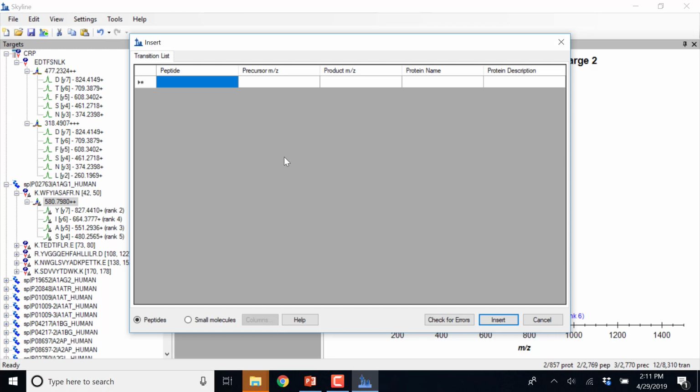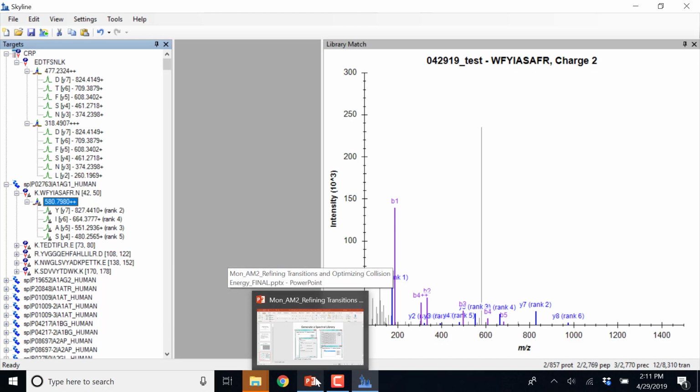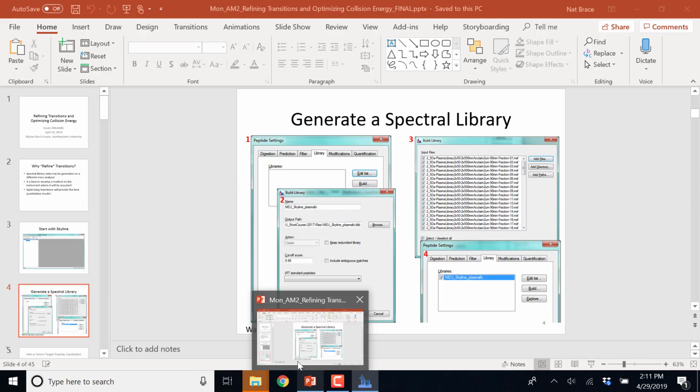Oh, yeah, sorry. Say okay now. Yeah, or cancel. It doesn't really matter, because this is just familiarization and playing right now. Okay. Any questions about this so far? Another question. Where is it? No question? Okay. All right.